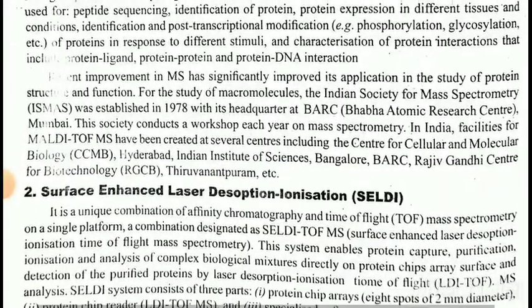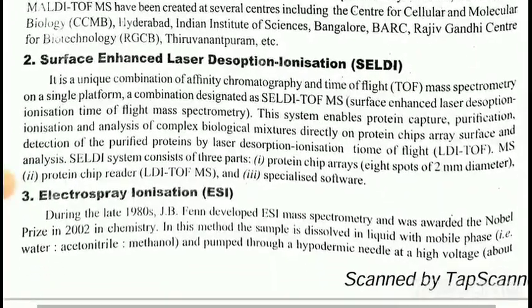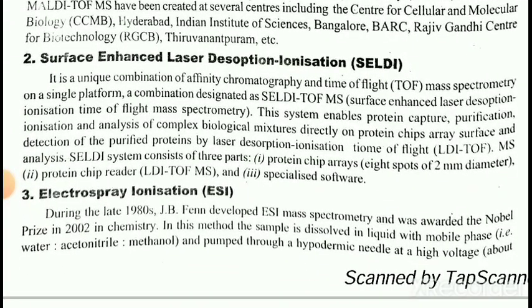2. Surface Enhanced Laser Desorption Ionization, SELDI. It is a unique combination of affinity chromatography and time-of-flight TOF mass spectrometry on a single platform, a combination designated as SELDI-TOF-MS, Surface Enhanced Laser Desorption Ionization Time-of-Flight Mass Spectrometry.